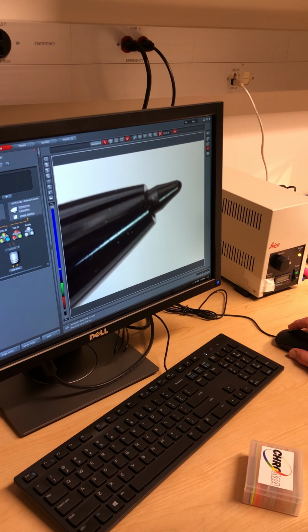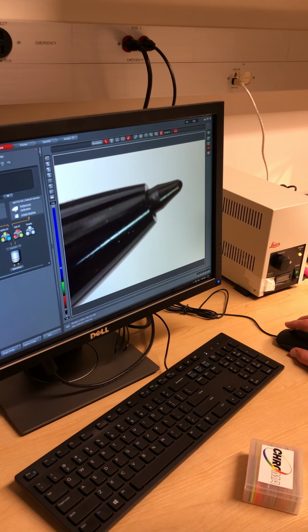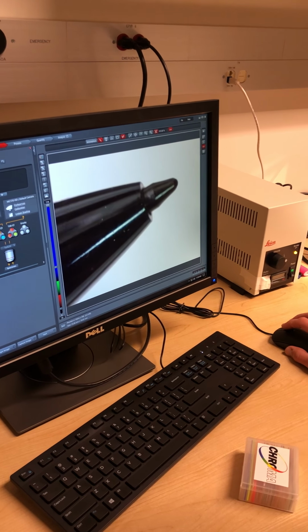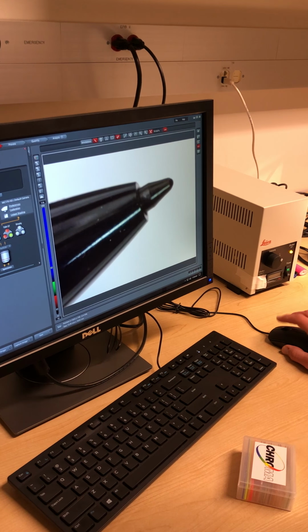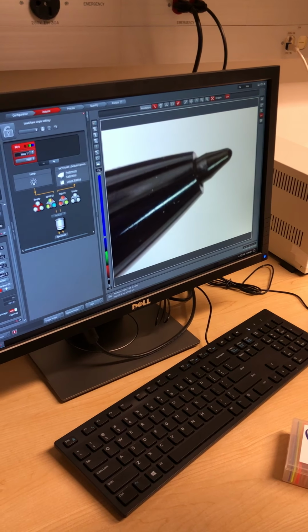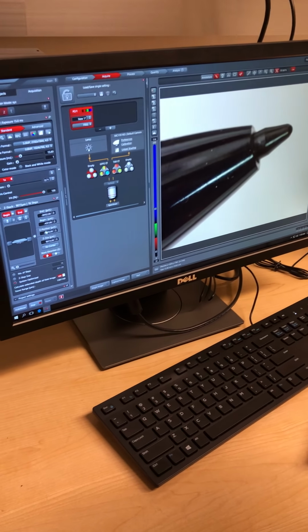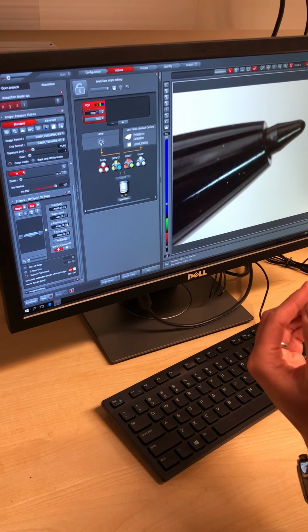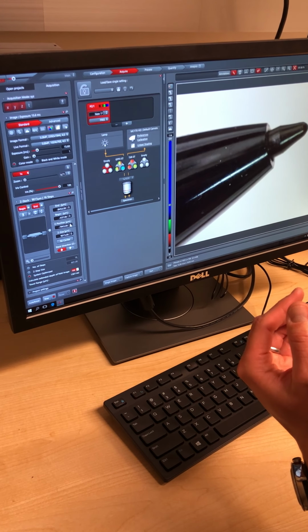Yes, sure, you can do it that way. It's probably just going to be a little slower. Okay. You can see it's moving there. The adjustment's just not as coarse. Now, for thinner specimens, that may even be ideal.